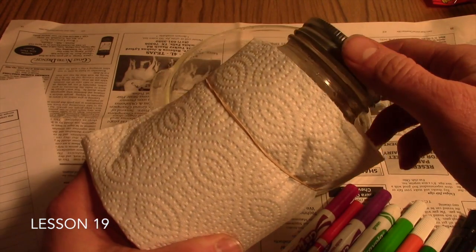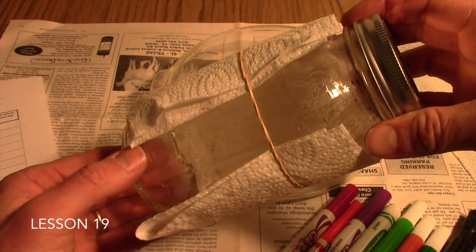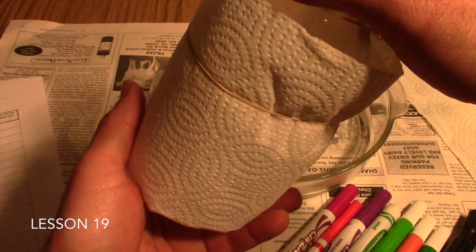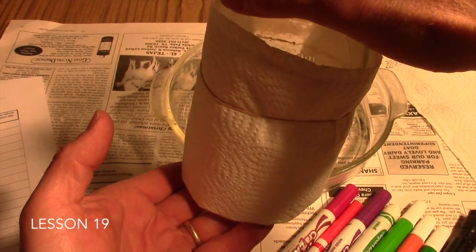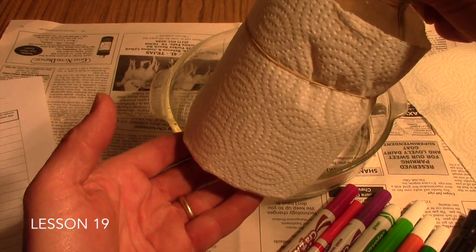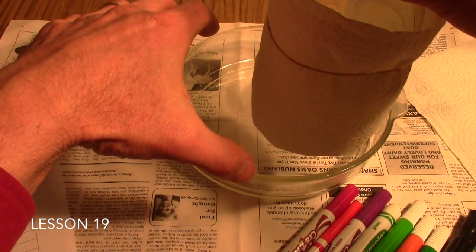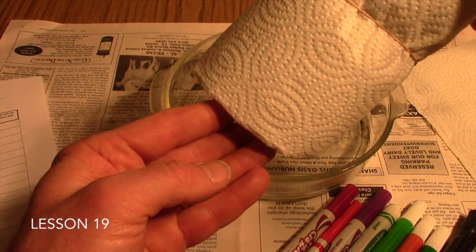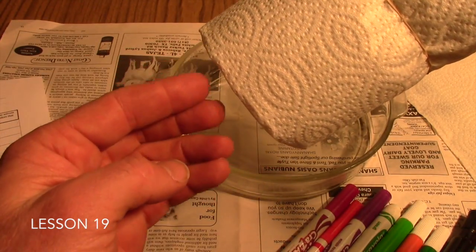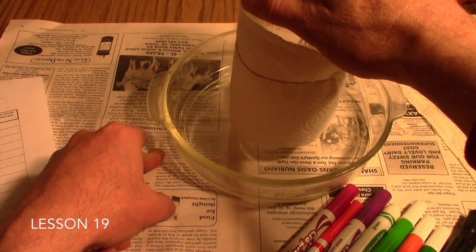A second item you'll need is a means of supporting your paper towel or coffee filter. We've just used a quart jar here and then a rubber band to keep the paper towel wrapped around the jar. If you use coffee filters, obviously you'll use maybe a smaller container and then place that coffee filter down over the top of it. The idea here is to be able to suspend the lower edge of our paper towel or coffee filter in another dish which holds our solvent.